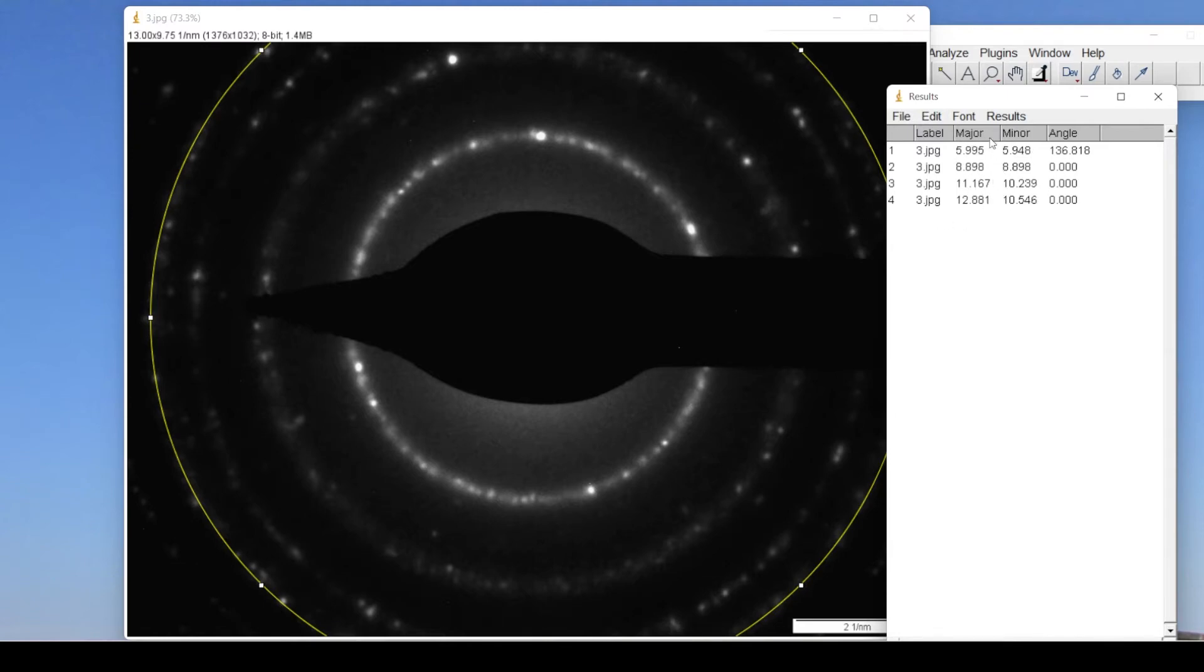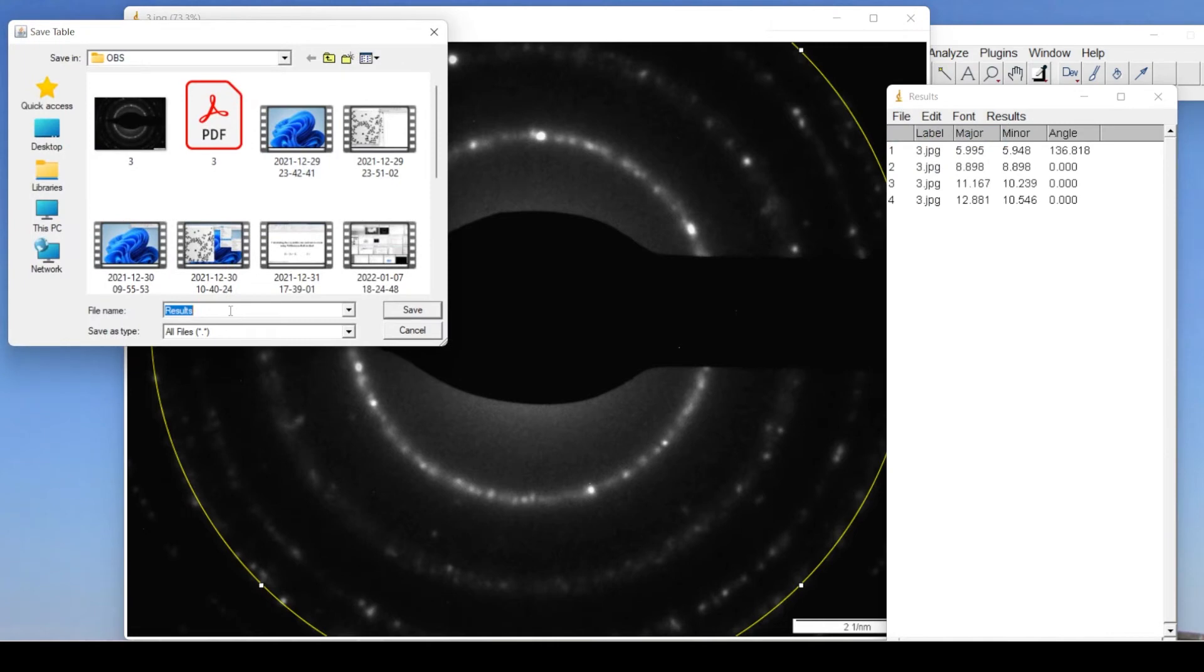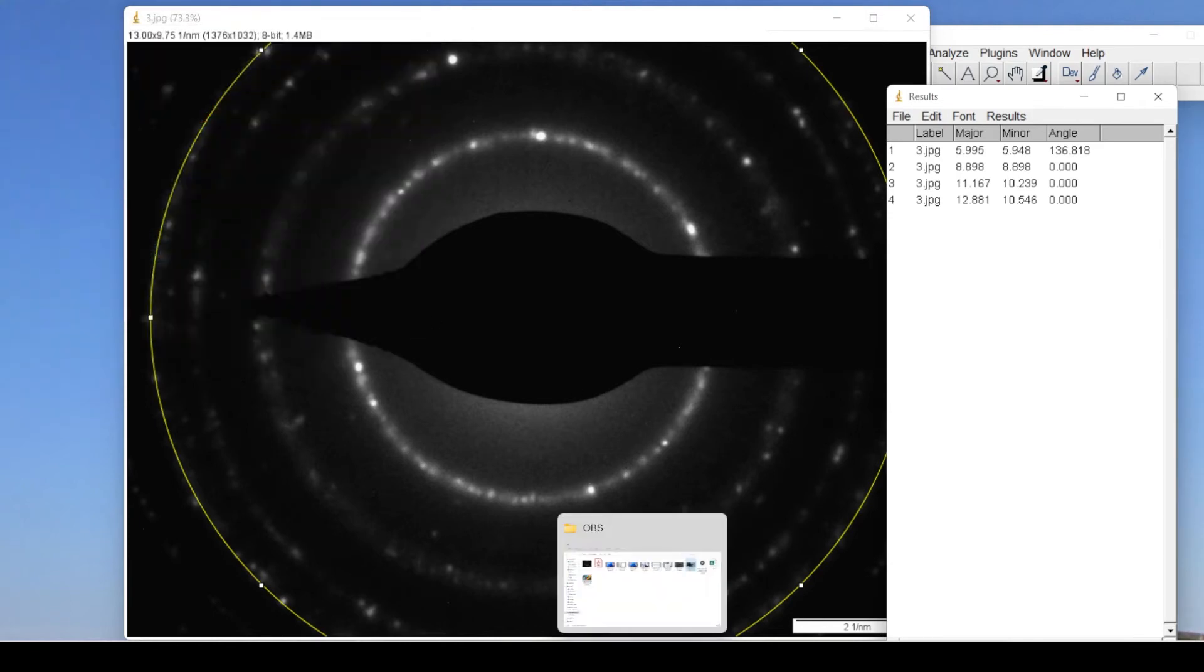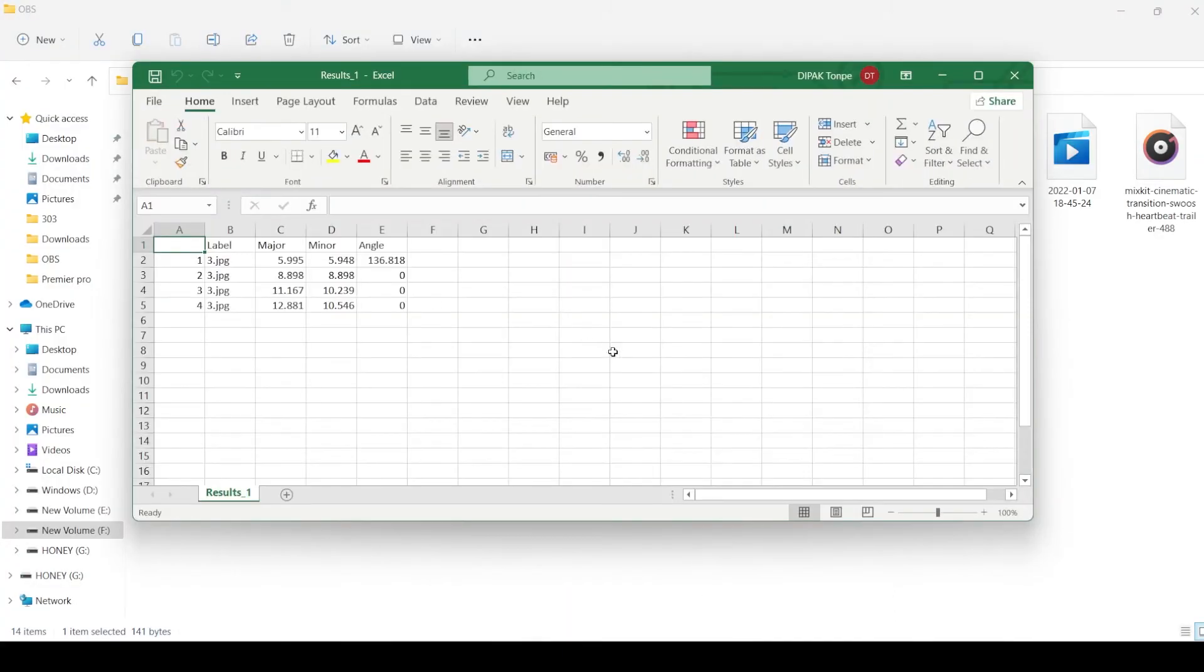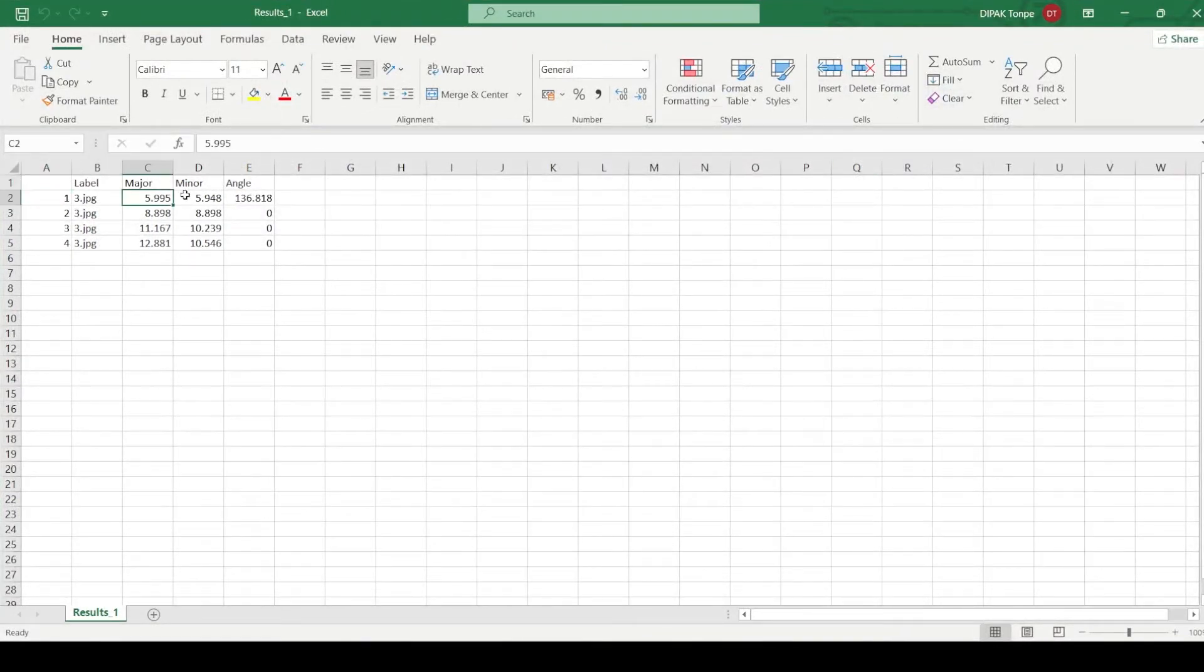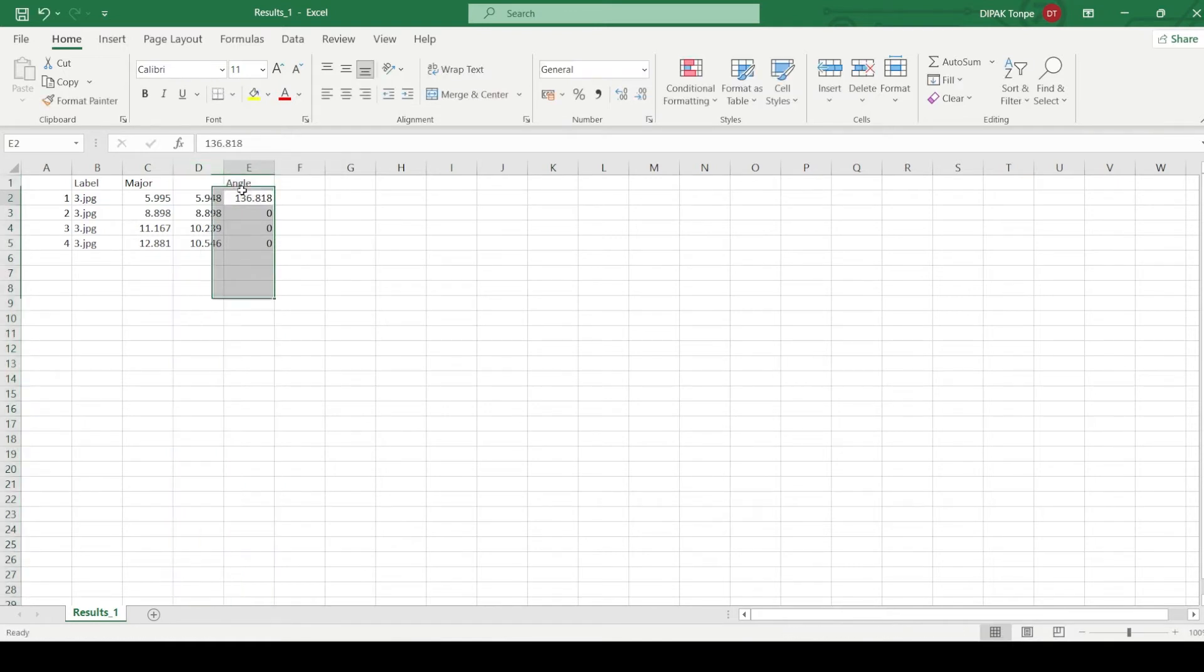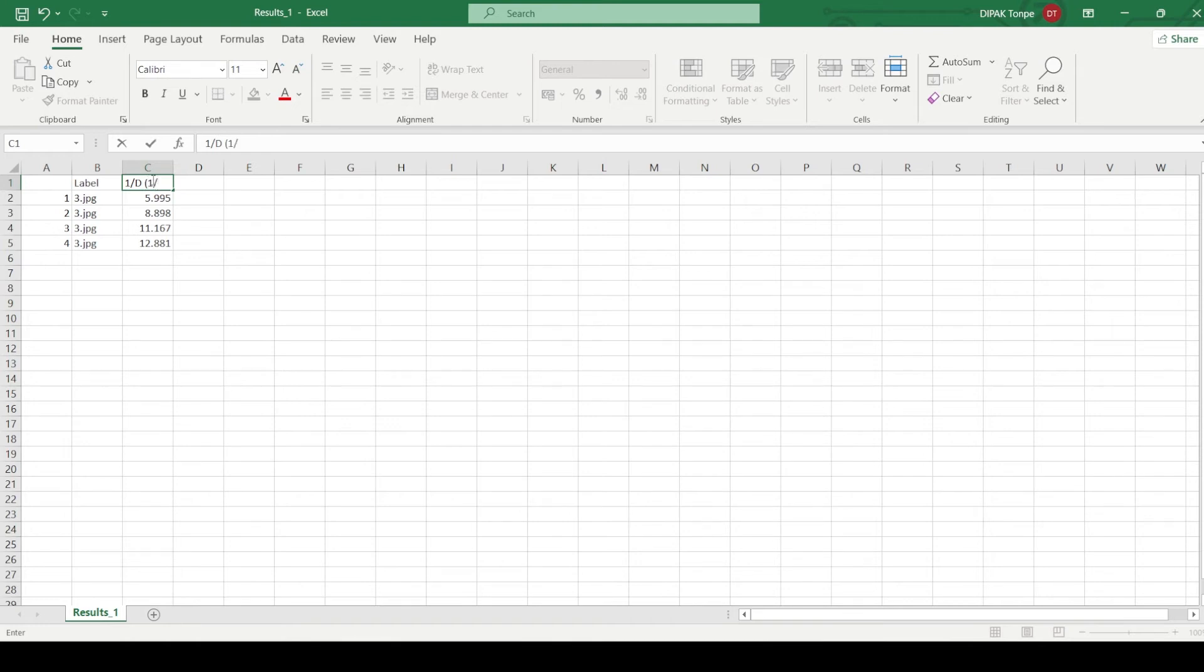Here in this data we can see the major and minor values and they are approximately same. We have to save this data. We will open the saved data. Here as we can see, there is a minor difference between major and minor. So we will only consider the major and delete the other two columns. This major is actually 1/d or diameter of the ring which is in 1 per nanometer unit.